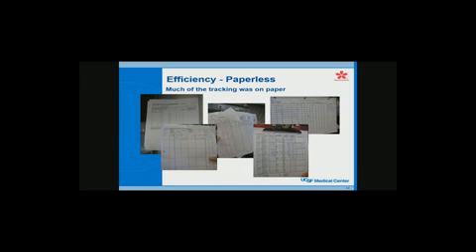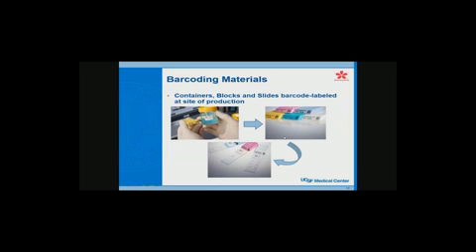These are examples of the logs we had: batch logs for the morning group, handwritten logs of things that were missed, or were missing, or that we had to add on because they weren't put in the system. Just all kinds of process logs, keeping track of the different types of blocks we cut during the day, so we could log our workload. We had a process board where people would write down how many blocks they cut of every type per hour, that sort of thing. So these are all manual processes. Every bit of this has now been automated and can be brought up in reports rather than writing down anything.